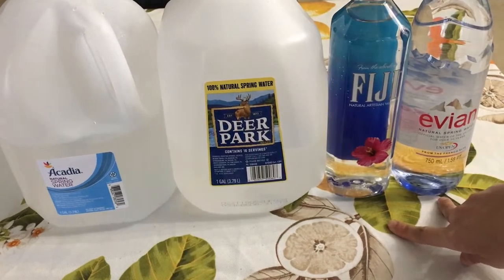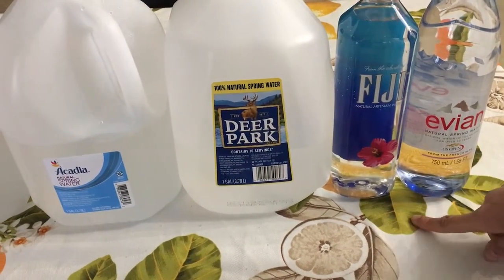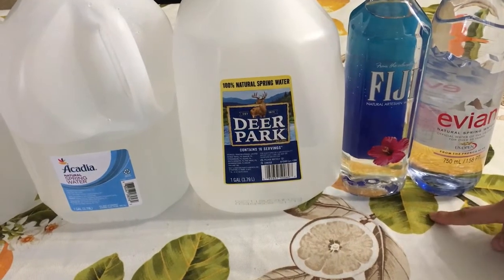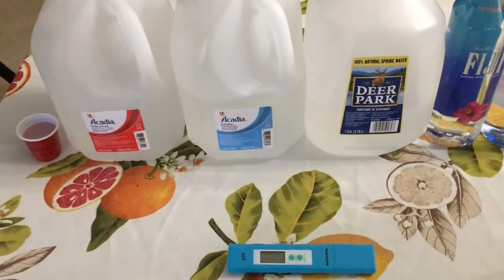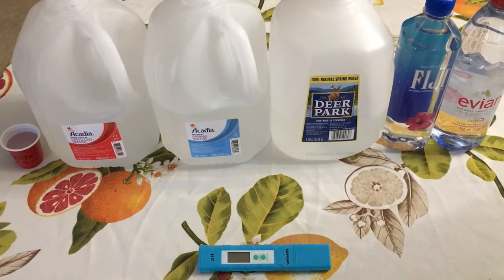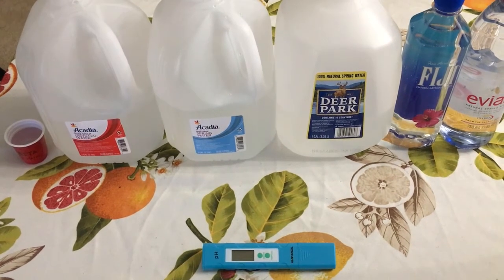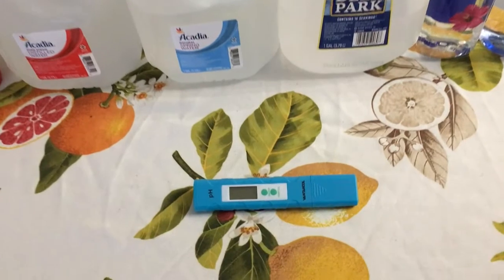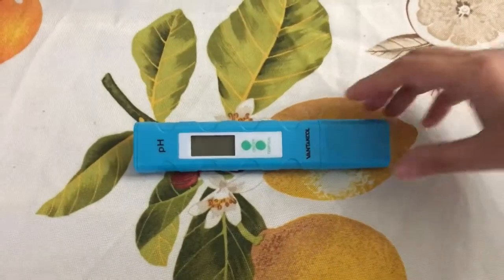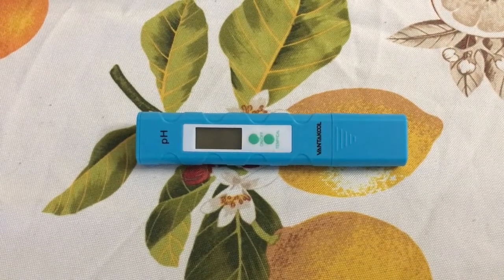These two brands are supposed to be good brands and we expect a good alkaline level in these two brands compared to others. The more alkaline the water is, it is supposed to be good for health, whereas the more acidic the water is, it is harmful for health. And here is a pH test unit, so let's start performing the test.